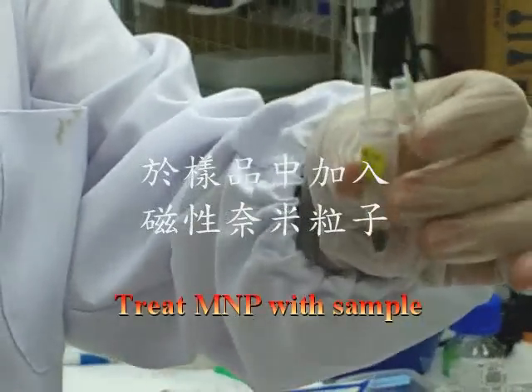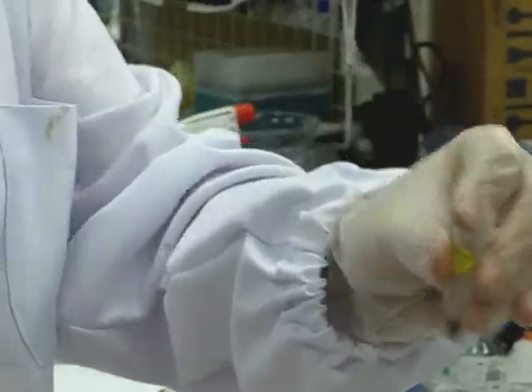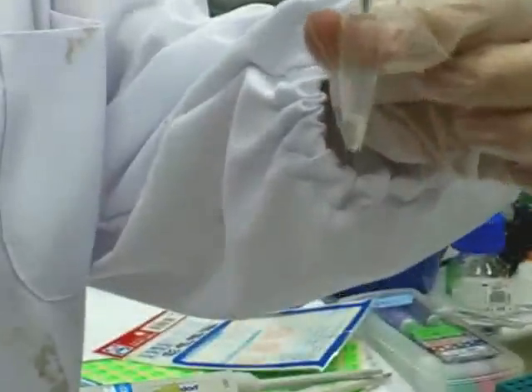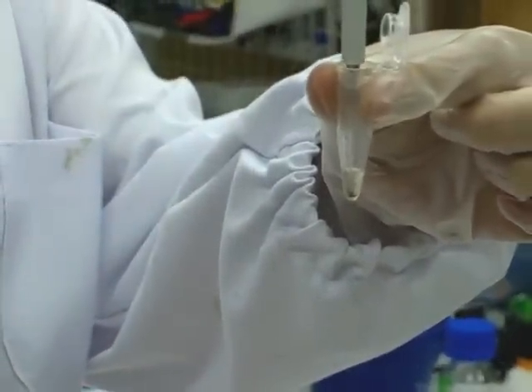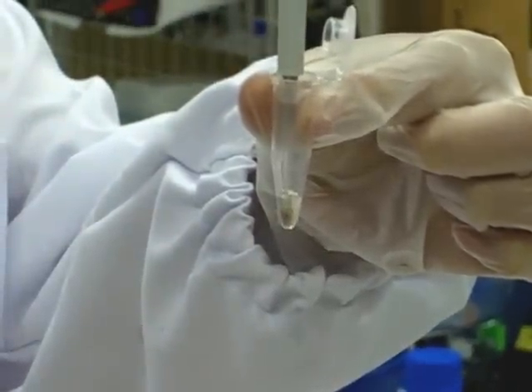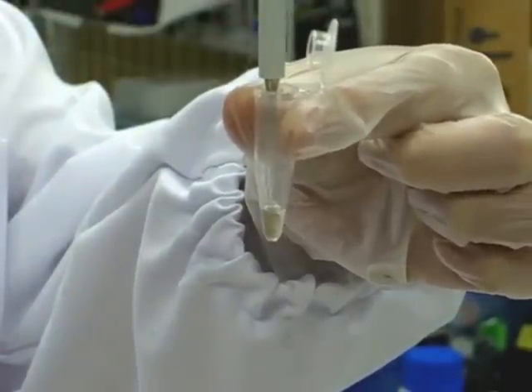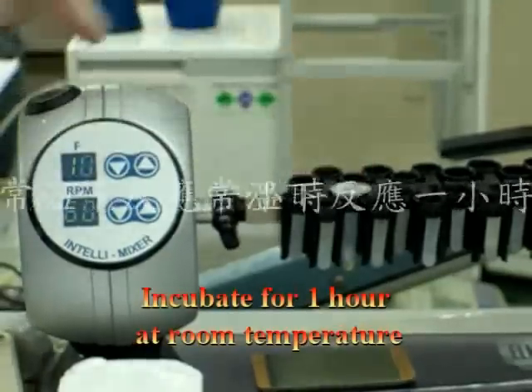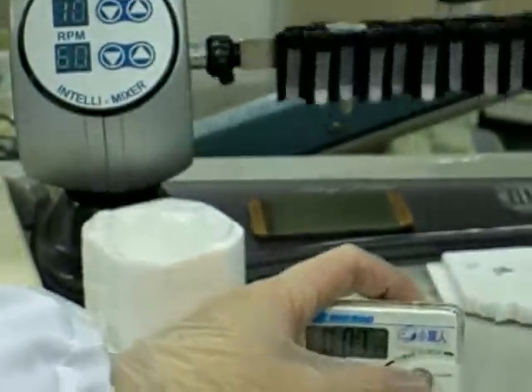Prepare the antibody-conjugated magnetic nanoparticles. The serum samples are treated with antibody-conjugated magnetic nanoparticles. The reaction solution is homogenously mixed and incubated for one hour at room temperature.